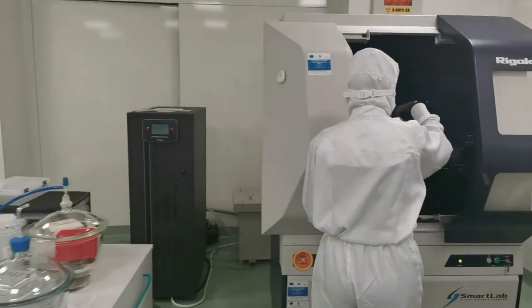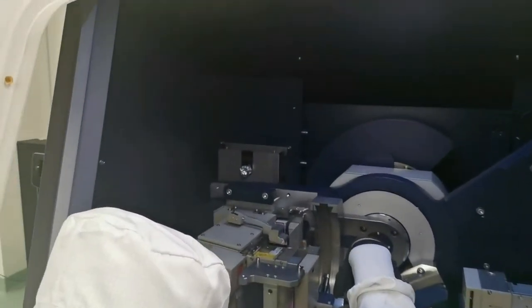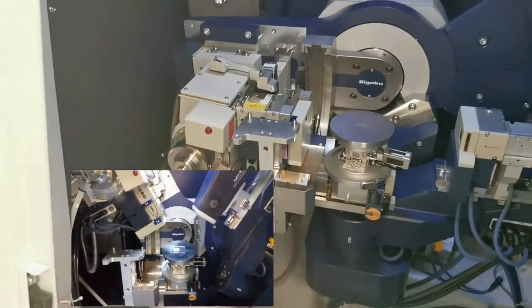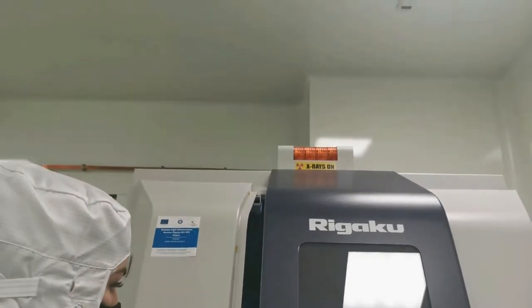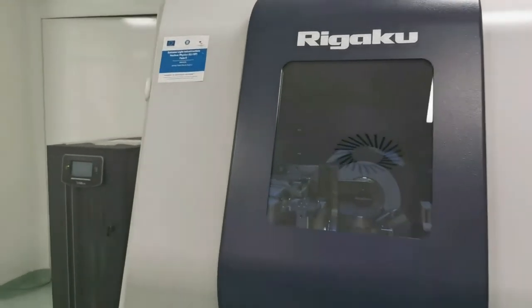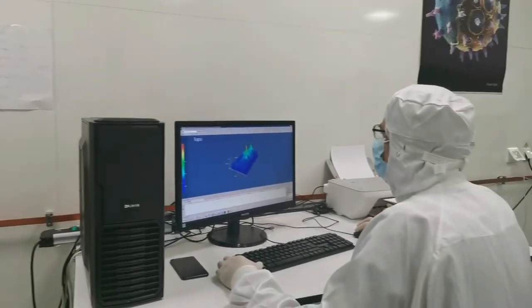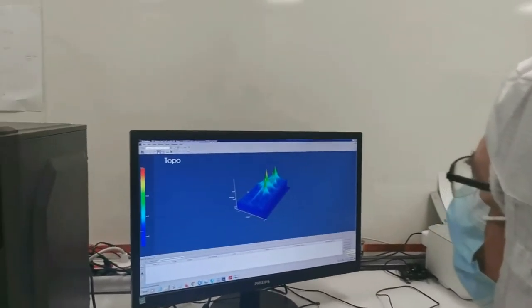The second equipment, a multipurpose X-ray diffractometer, is dedicated to high-resolution, microstructural, and quantitative analysis of powders, thin, thick or multi-layer films, but also of bulk samples and nanoparticles of materials with crystalline, amorphous, and nanocrystalline structure. The XRD equipment is used to analyze the composition, orientation and texture, strain and stress of the samples, thickness, density, surface uniformity, phase identification, and size distribution of the samples.